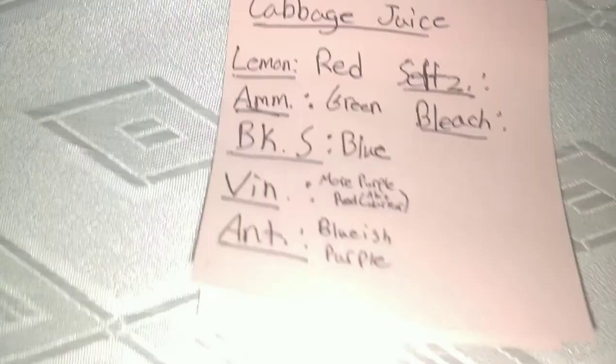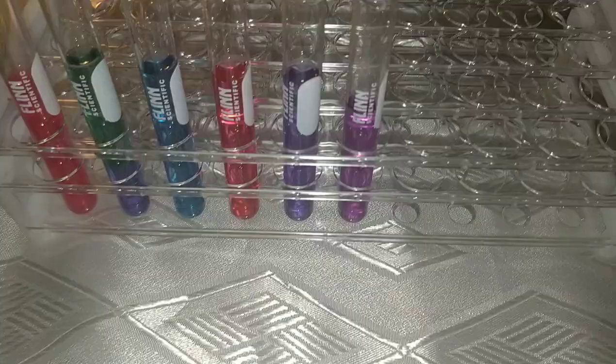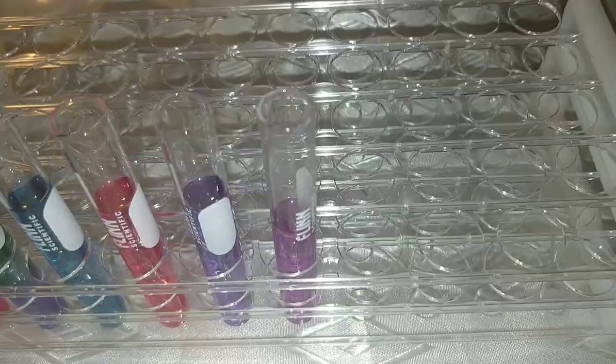I've refilled the final test tube — the one we used for bleach — since it had no color, so that we could test the seltzer water. Adding the seltzer water, I would say it barely changed the color, made it just a bit lighter almost. I'll write that down — it stayed purple.